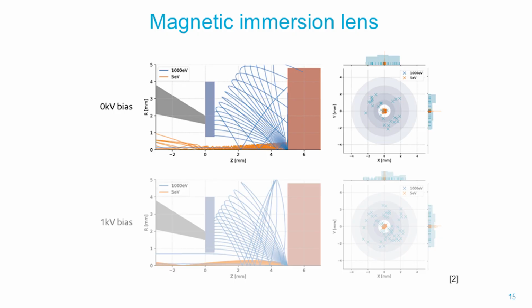So the upper image here is a situation, again, with electrons exiting the sample, in this case without electrostatic immersion, but with a magnetic immersion. And we see both for the secondaries and the backscattered electrons that they start to swirl and oscillate around the optical axis. Specifically for the secondary electrons, where the energy is low, we make a lot of windings towards the optical axis and back out when they go up into the sample.